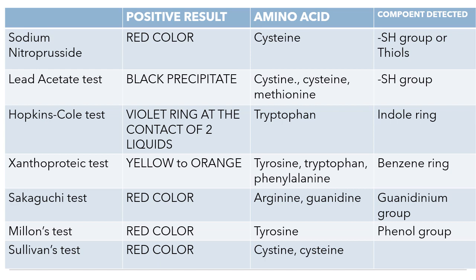And then you have Molisch's test. This one is a test for a glycoprotein. If a protein solution is treated with Molisch reagent and layered with concentrated sulfuric acid, a violet ring will develop if a glycoprotein is present. This one is for the carbohydrate present in your protein. Sorry, it's Millon's test, and Millon's test will give a red color.